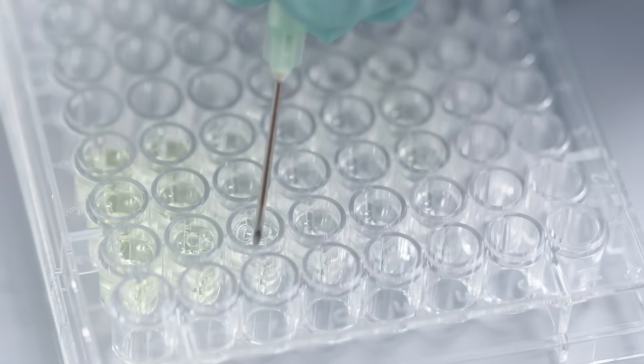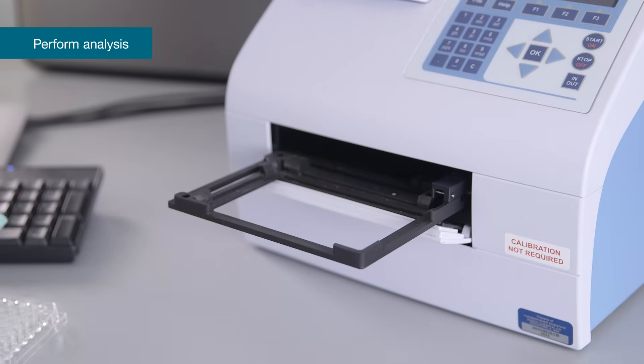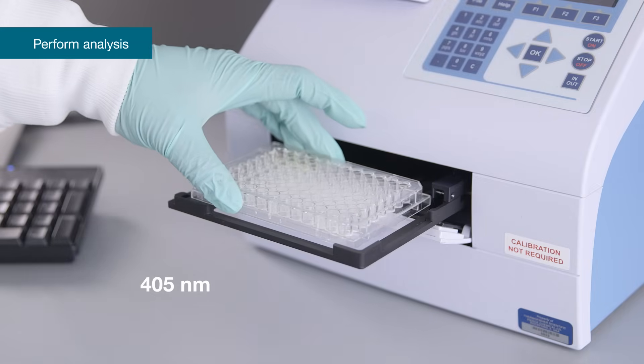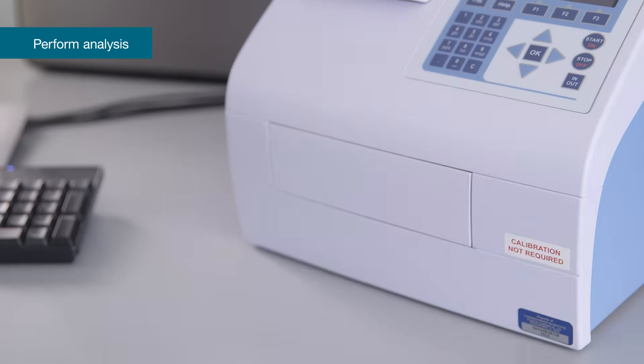Watch for bubbles as they will affect the optical reading. Use a micropipette tip or a needle to eliminate the bubbles. Read the optical density at 405 nanometers immediately after assay completion. If the plate is read at a later time, keep it covered to avoid evaporation.